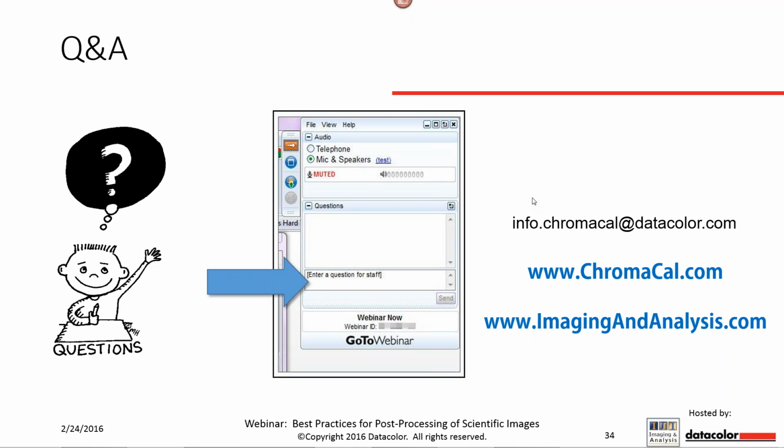Okay, here's an easy one. Mark, I'll let you take this one. How much does Easy Image Prep cost, and are there any other fees?